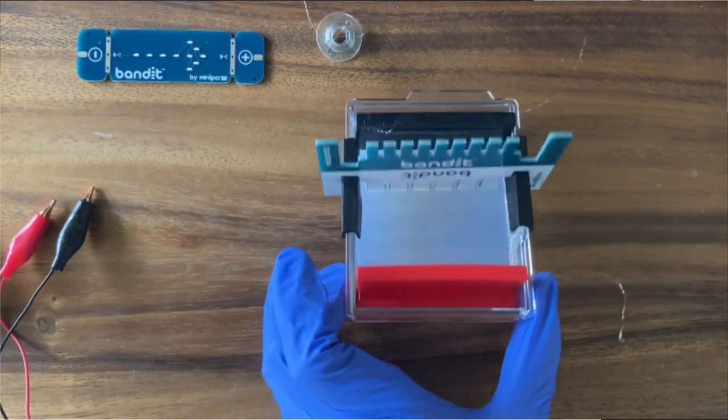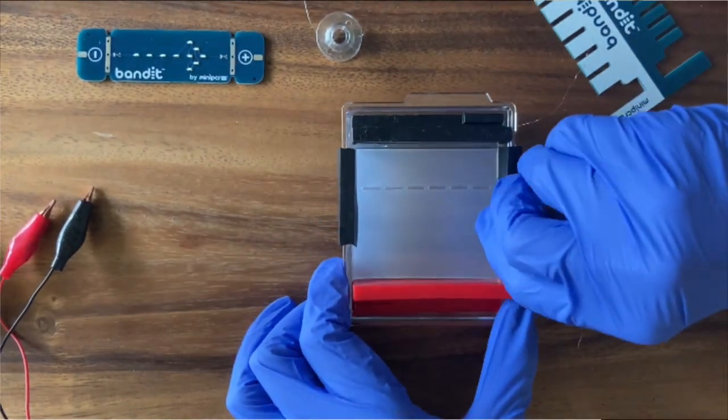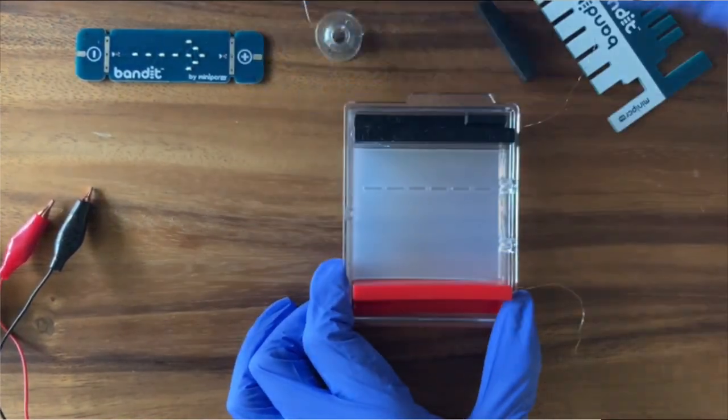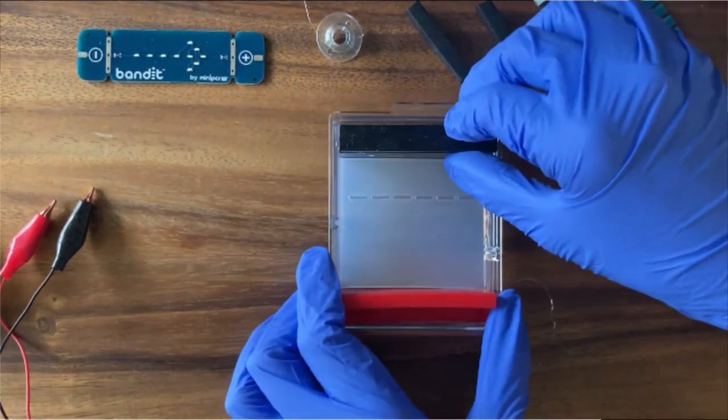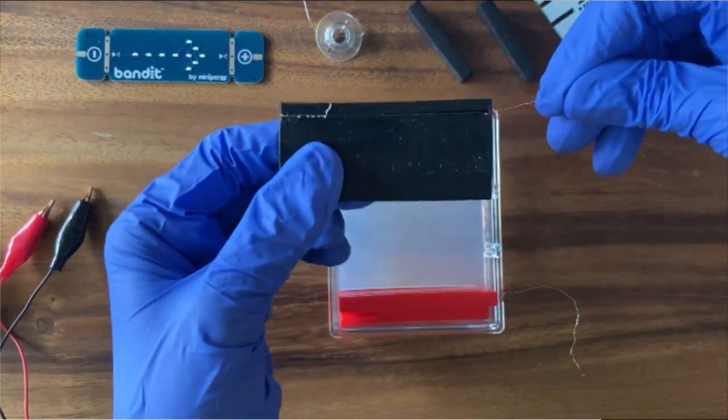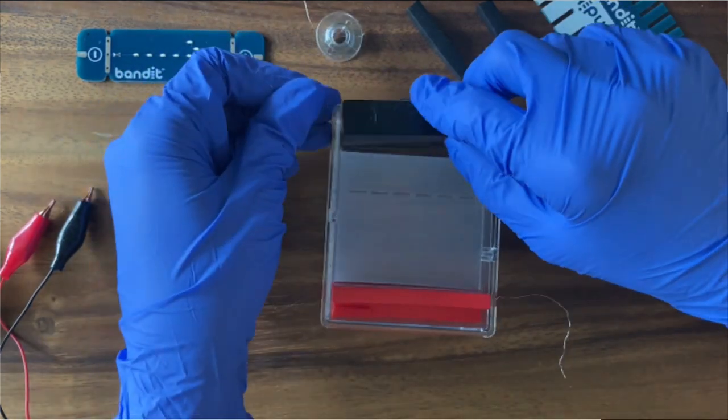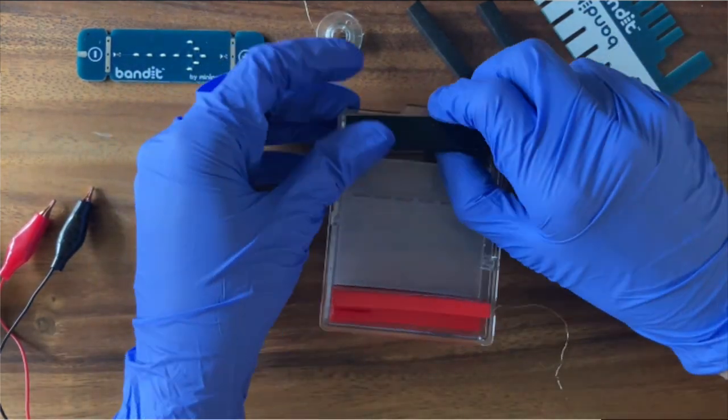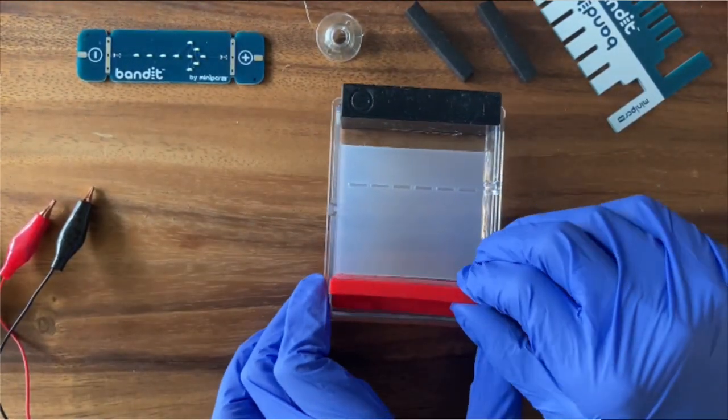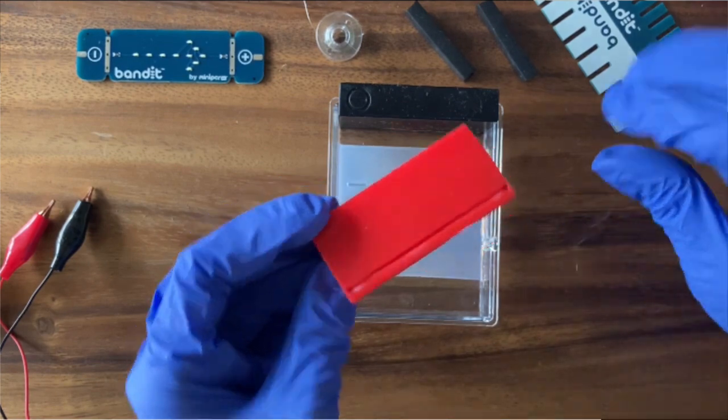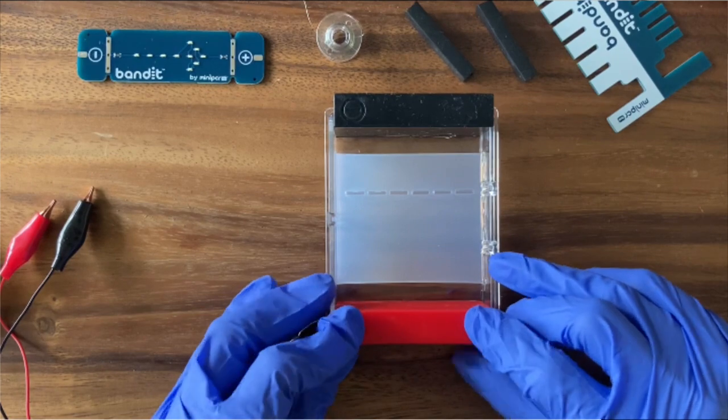Here's our gel ready to run. It's hardened at this point. I'm going to pull the comb out and pull the comb supports off the sides. You can see the wells that the comb left behind. They look just like we want them to. Nice little rectangular pockets. I'm going to take my electrode dams now and flip them from dam mode back into electrode mode. If I flip them upside down, that'll place the electrode wire right at the bottom of the chamber and it'll leave this end of the electrode free for me to clip onto.